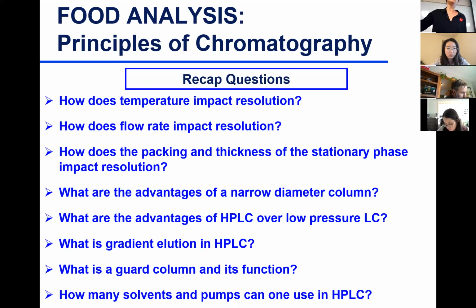If the flow rate is high versus low. Anybody remember that? Okay, let's see. So N would say higher flow rate, less resolution, peaks closer together. Flow rate is high and less resolution. Okay, well, what about if the flow rate is very slow? Well, that's correct what you're saying. With a very high flow rate, yes, things will move very fast and you might not get enough time to separate. But on the other end, if the flow is very slow, what do you think might happen, Kat?